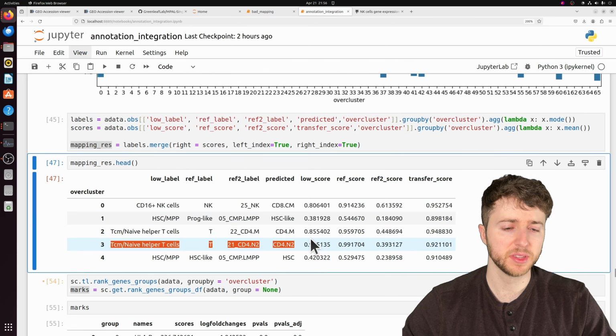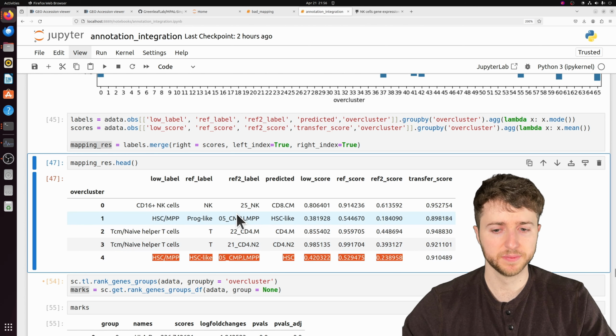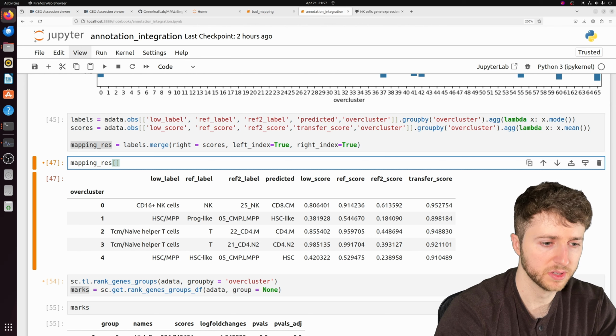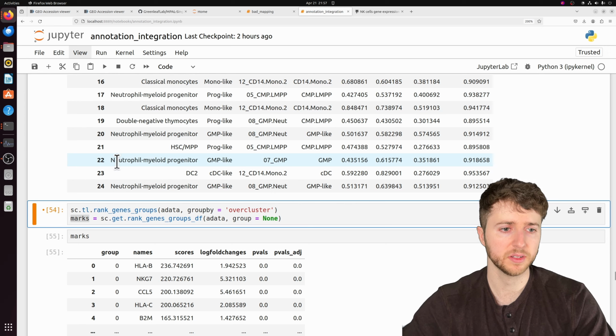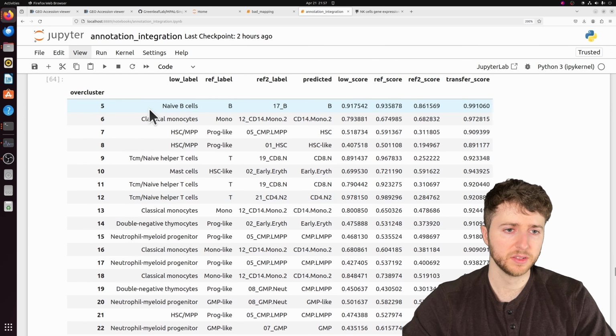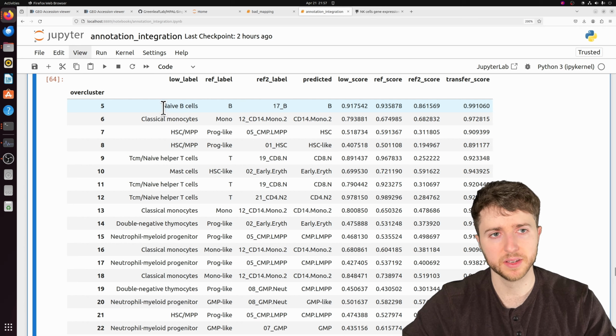3, it's going to be the same thing without going through all the different lines of evidence. 3 is also a T helper cell. 4 turns out to be another AML blast population. So we can start moving through this instead of looking at all of them, just to make it a little easier. So 5 is a new population. So all 4 agree that it's a B cell.